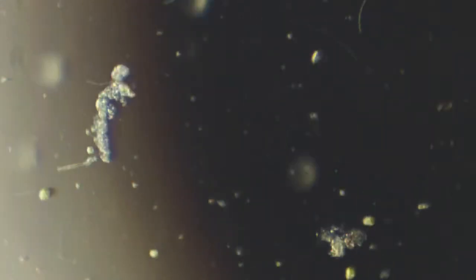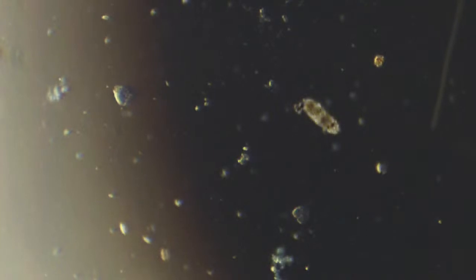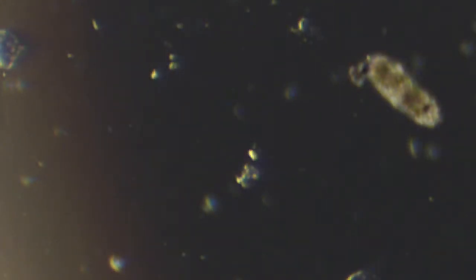All right. There's a little dude spinning like crazy. I love when you see these guys just spinning like maniacs. Always entertaining. Little mini flagellates going bonkers. Oh, I see the edge of the slide is starting to dry up. See the salt crystals are starting to form.